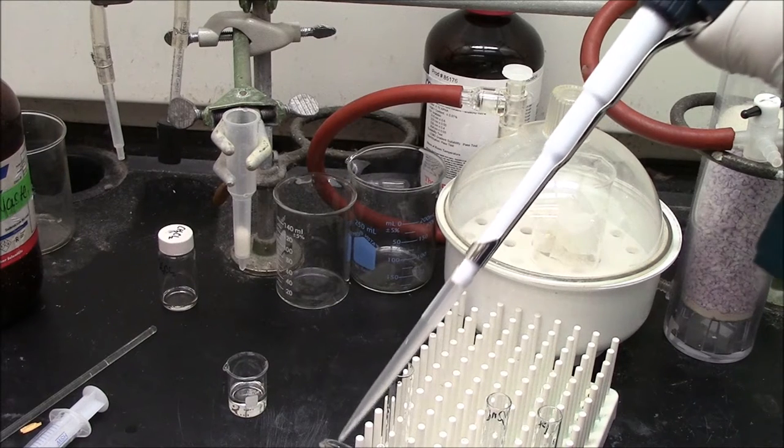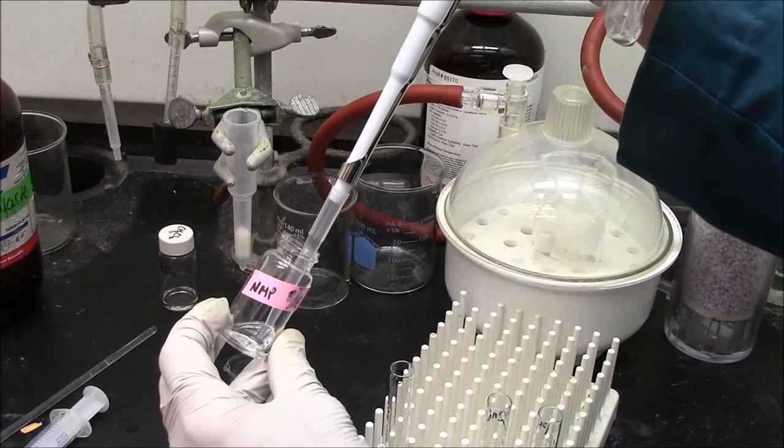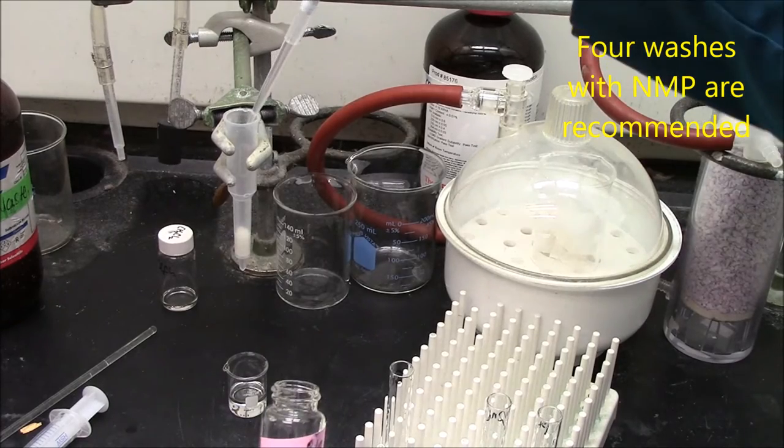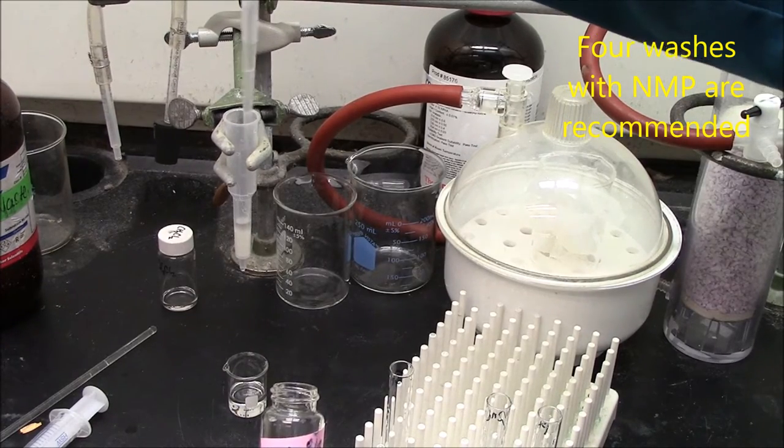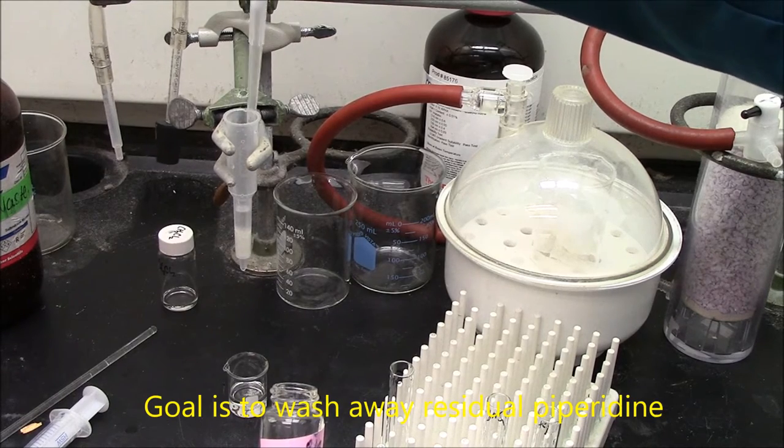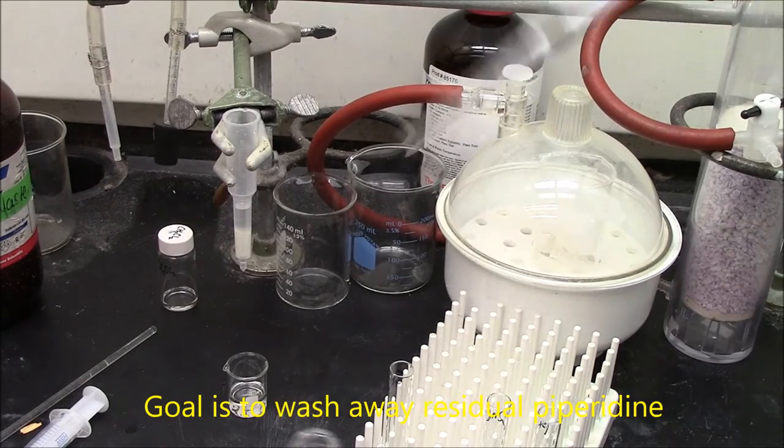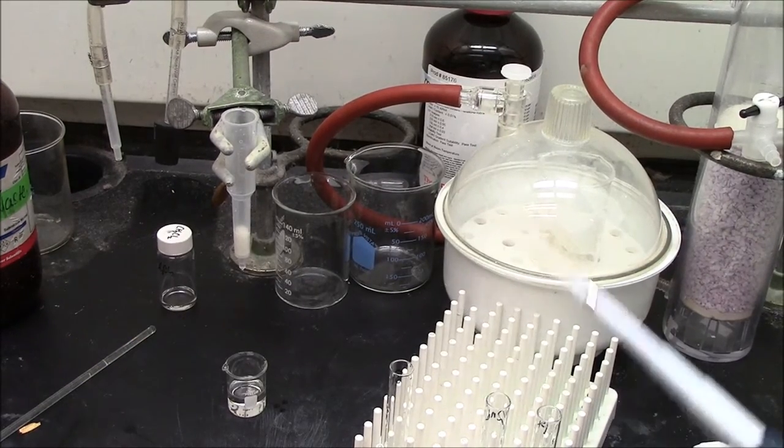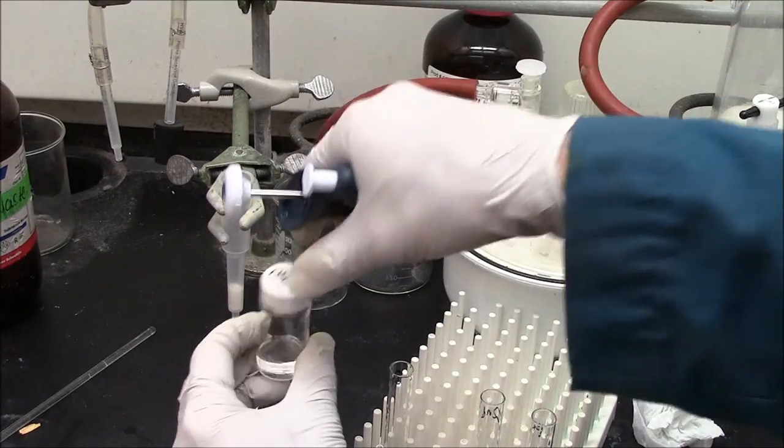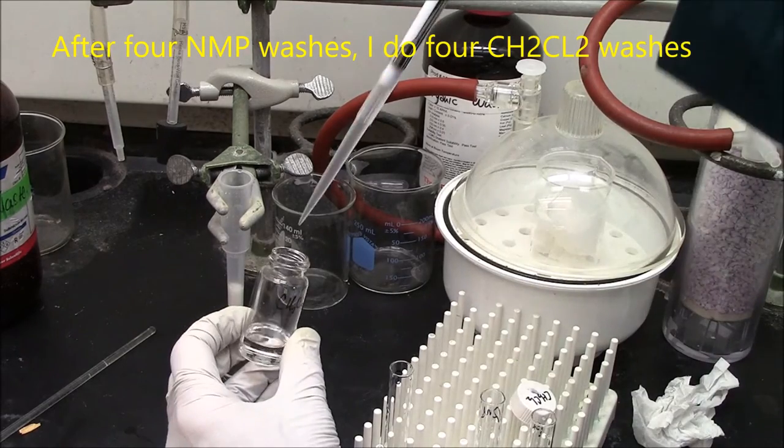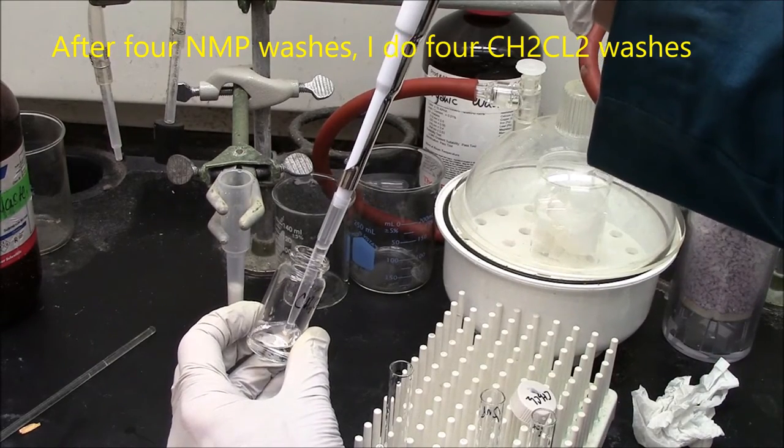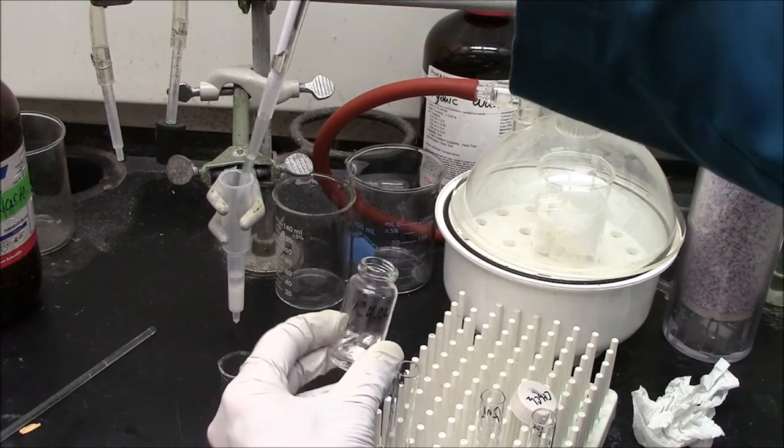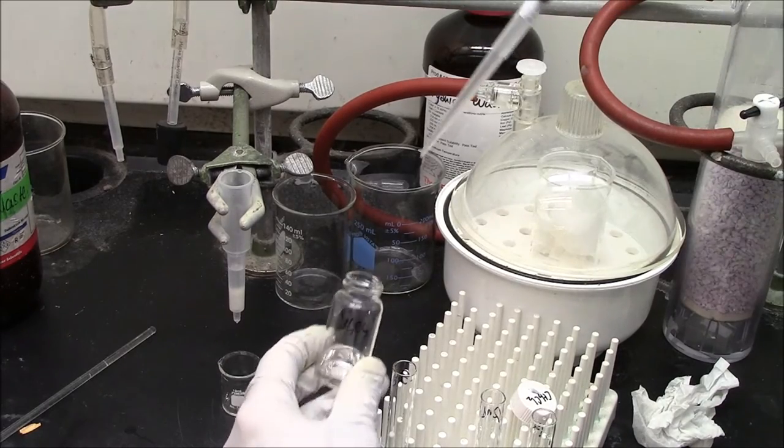In solid phase synthesis, it's very important to wash the beads after important steps. This gets rid of unwanted reactants. I'm now washing the column with NMP. I'll do this three times with one milliliter each. I am trying to wash the sides of the walls as well as the beads themselves. I'm trying to get rid of all traces of piperidine. Now I'll wash with dichloromethane, CH2Cl2. Again, my goal is to get rid of any traces of previous reactants. Dichloromethane is much runnier, much less viscous.